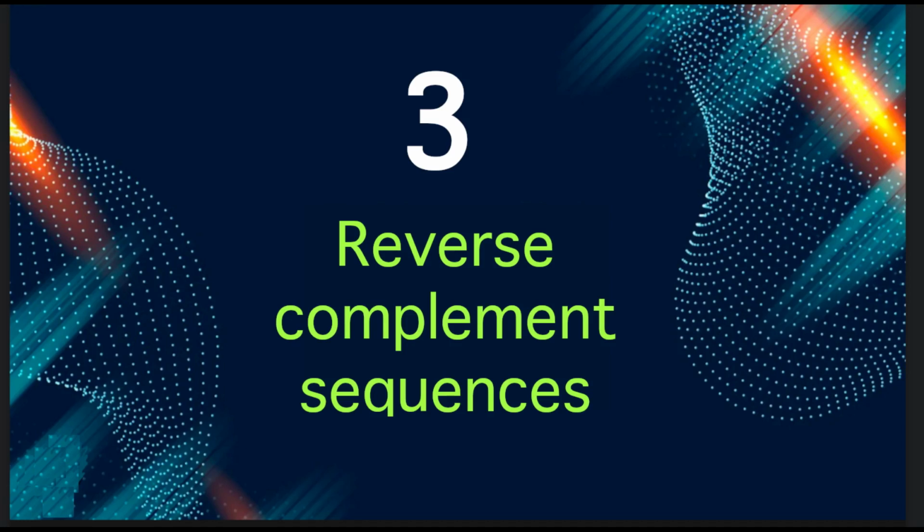We will now produce the reverse complementary sequences of a whole FASTA file. So we will do that again with bioawk, indicating the format of the input file, and then we'll just print a greater than sign just to preserve the native FASTA format, the name of the sequences.